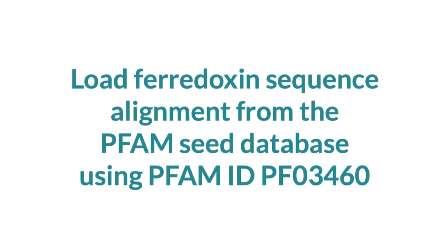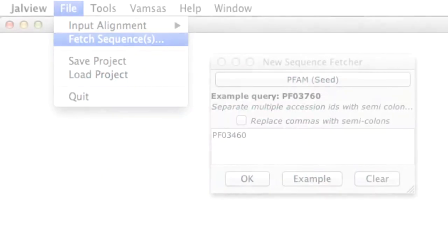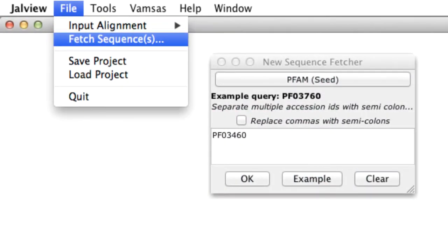I've already loaded a Ferrodoxin sequence alignment from the PFAM seed database using the PFAM ID PF03460.